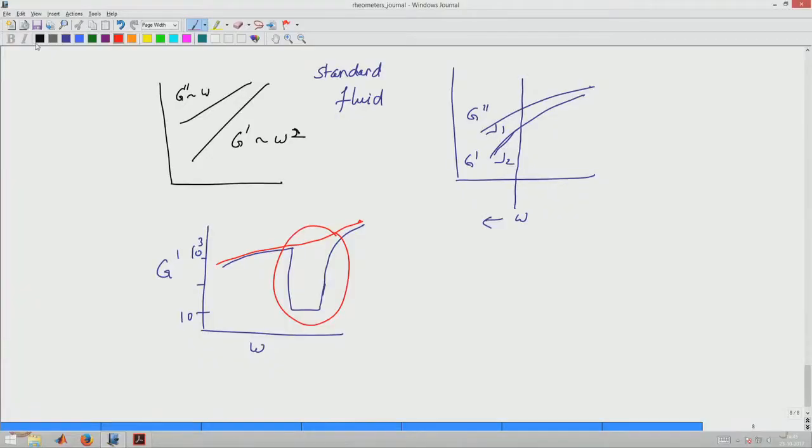In fact, this kind of dip that I talked about is generally observed for low viscosity samples and high inertia, and at least one plausible explanation of such a dip is based on resonance of the instrument and material combination.